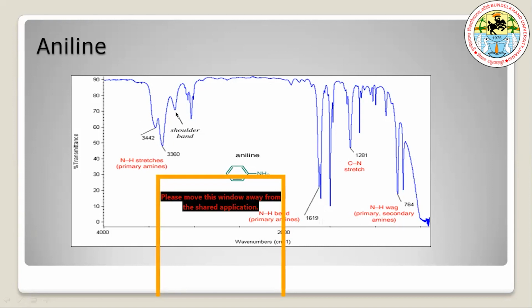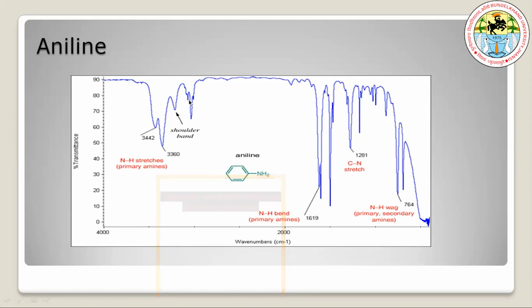Slightly higher position पे 3000 centimeter inverse के आपको peak observe हो रही means it is aromatic compound. इसके साथ ही साथ 2900 centimeter inverse पे peak आपको observe हो रही है, इसका मतलब है कि इसमें H vibrations aliphatic nucleus से associated भी present.